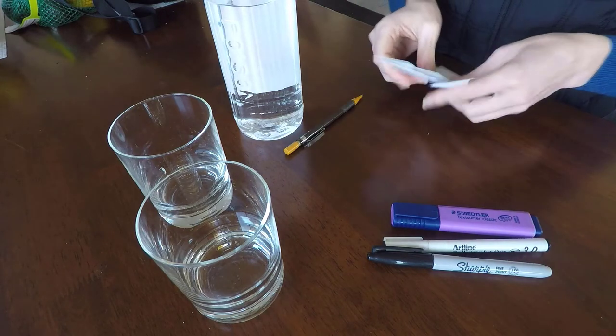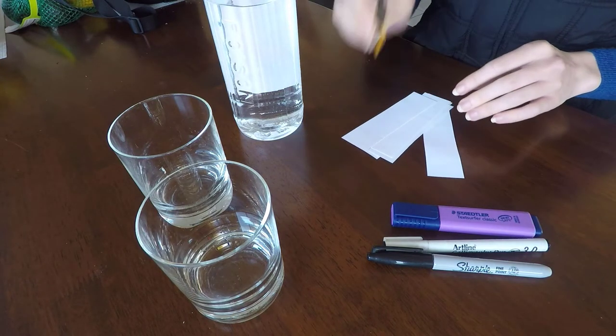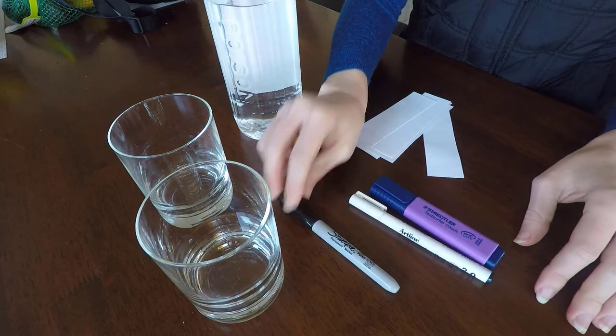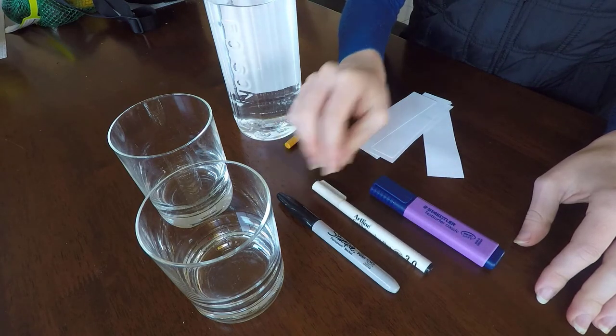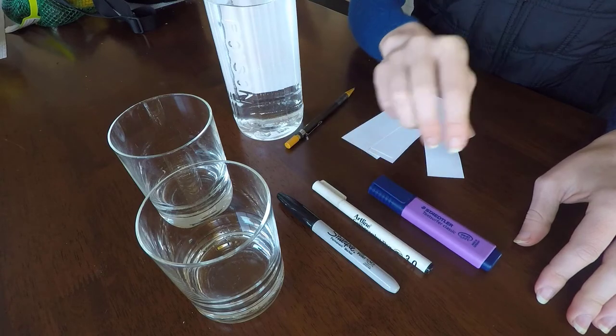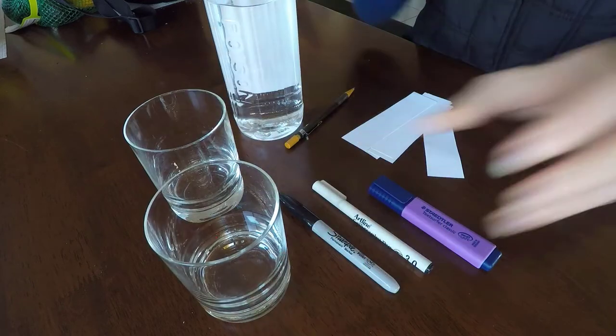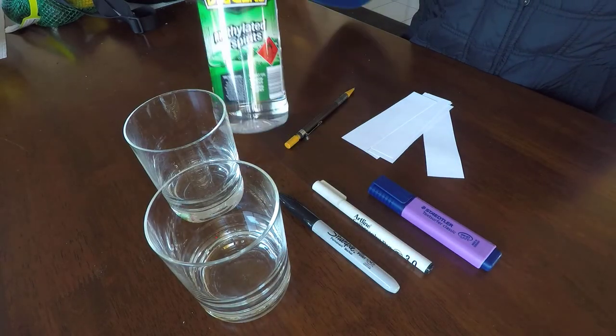What I used for this demonstration was some paper, a pencil, some different coloured markers — I used two different black ones and one purple — two glass containers, and some methylated spirits.